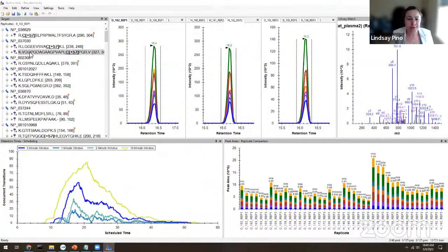So it doesn't have anything to do with the MS2 peaks. It doesn't have anything to do with points across the peak. It's just DDA. So was your DDA search able to find that peptide in your spectra?